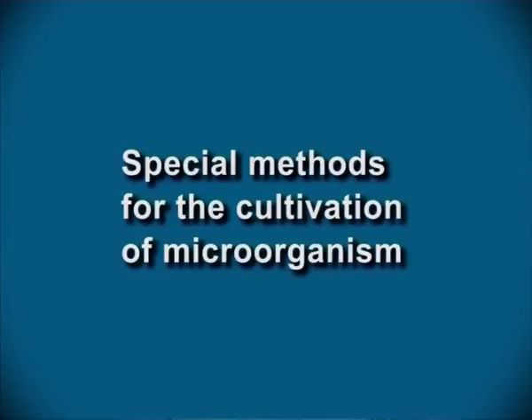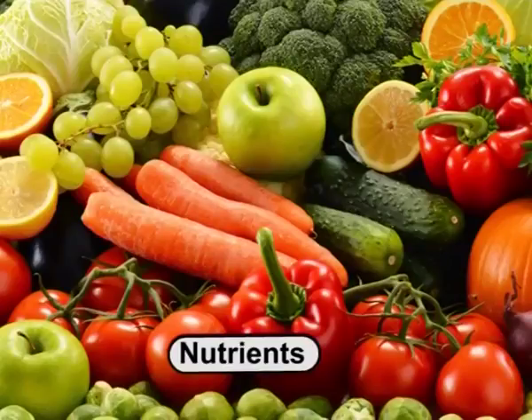Special methods for the cultivation of microorganisms. Dear viewers, the artificial culturing of microorganisms requires a supply of necessary nutrients along with the provision of appropriate conditions such as temperature, pH and oxygen concentration.